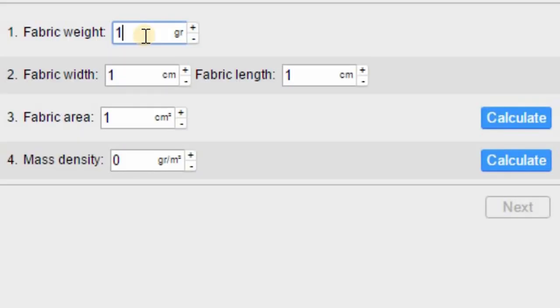Afterwards, you'll need to enter the Mass under the Mass Calculation section. Fill in the fields for Width and Length of the sample fabric strip and use the average weight you calculated previously. Click the first Calculate button to get the net area. Click the second Calculate button to get your final mass reading.